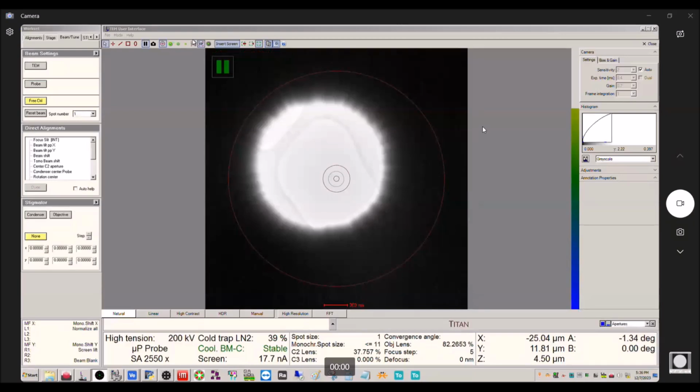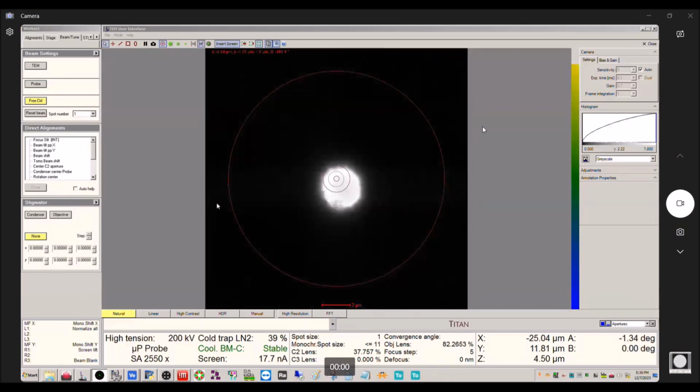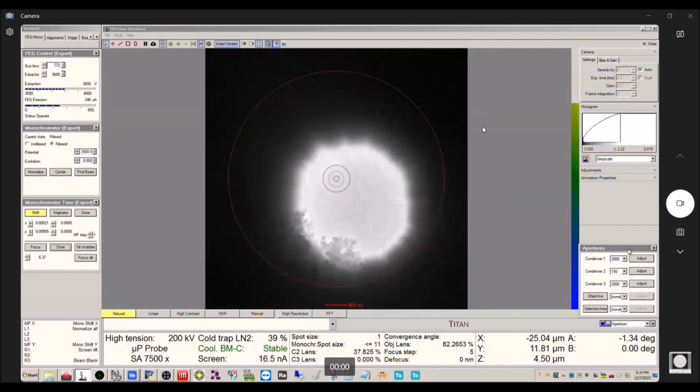Okay, all right, so we can go ahead and unpause here. And there's my beam. So this makes it easy now to work with here. We have to do the same thing that we just did, where we can do this again just to show the example.